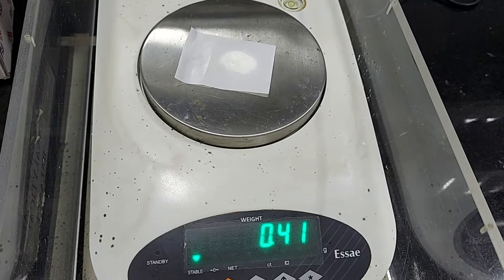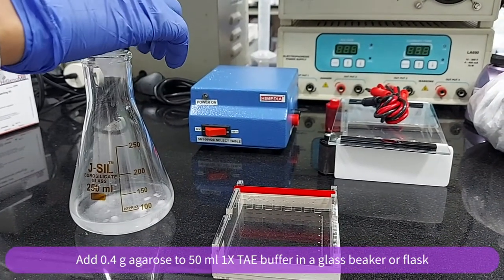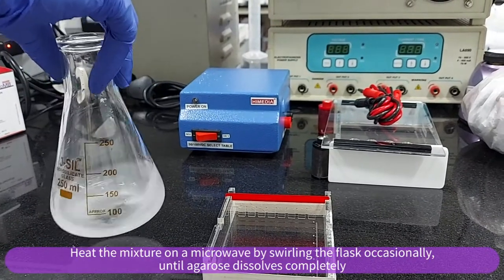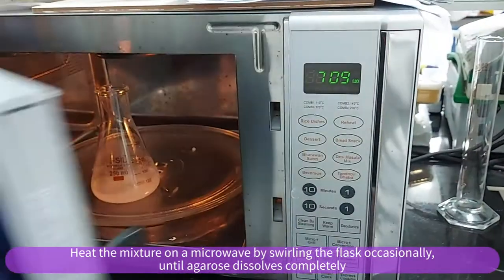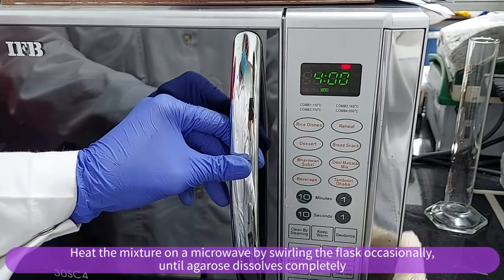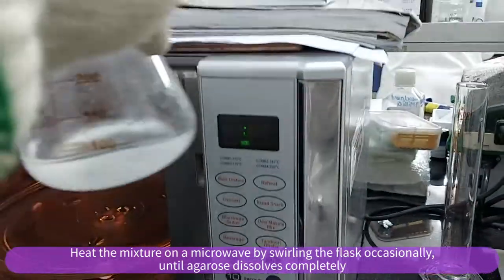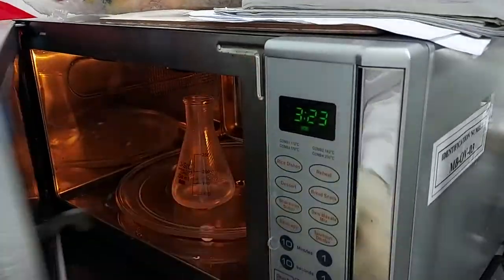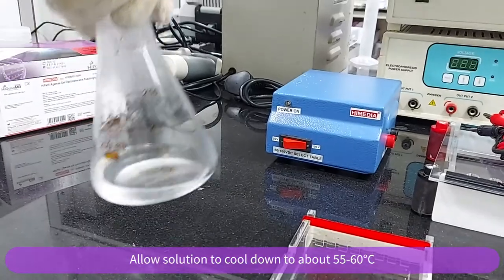Add 0.4 gram agarose to 50 ml 1x TAE buffer in the glass beaker or flask. Heat the mixture in a microwave, swirling the glass flask occasionally until agarose dissolves completely. Allow solution to cool down to about 55 to 60 degrees Celsius.